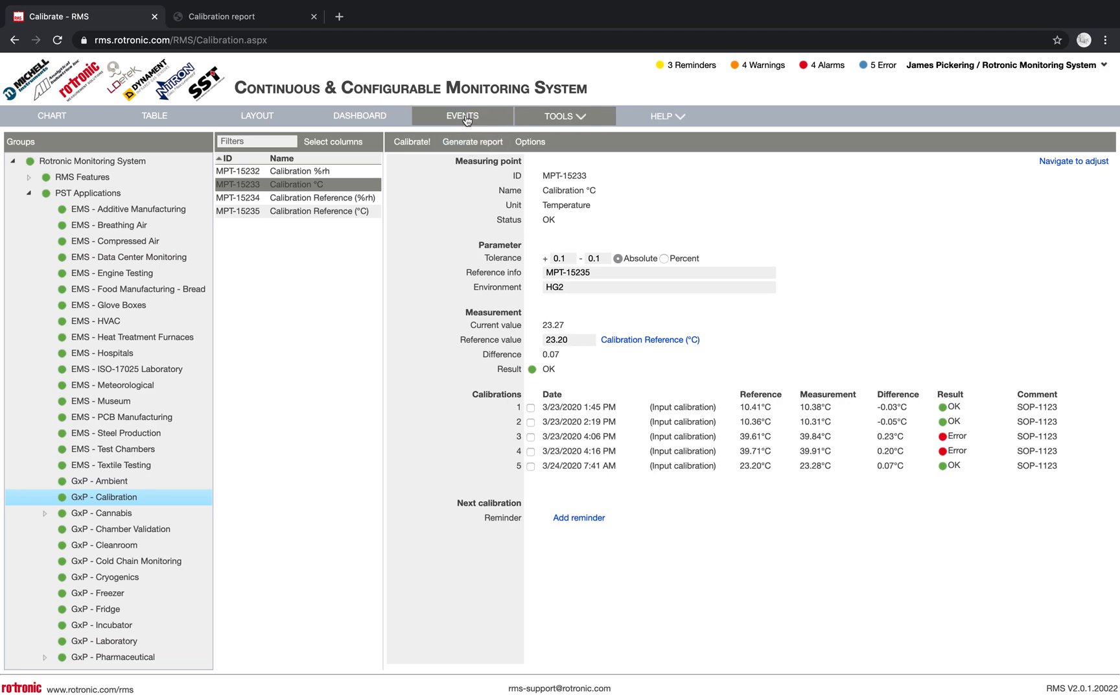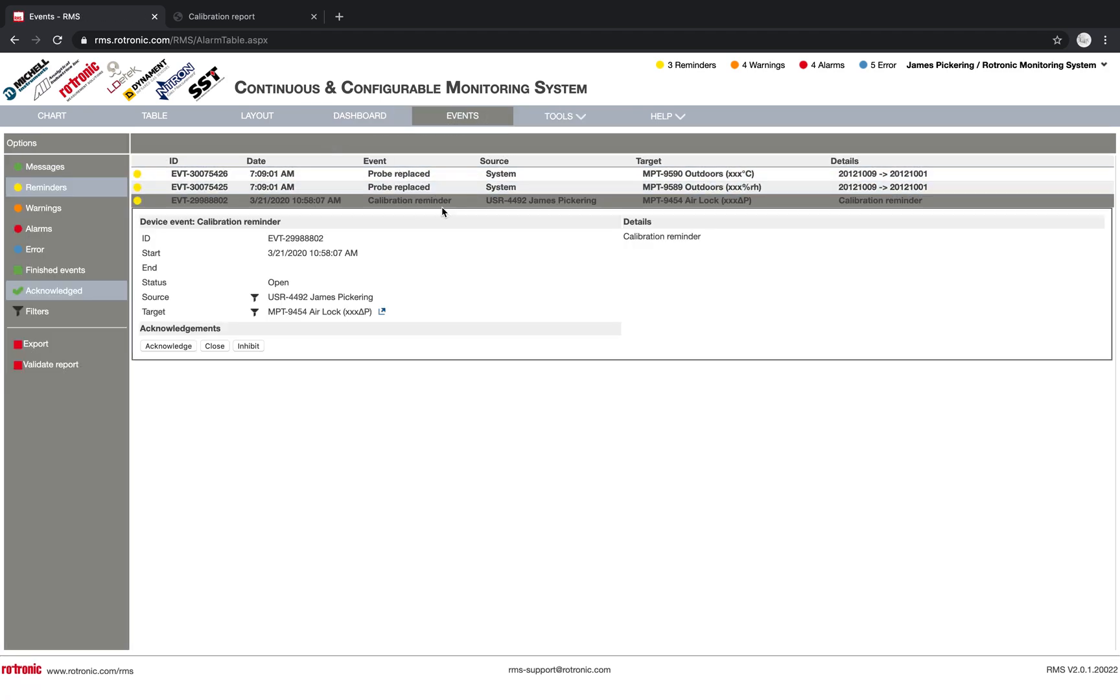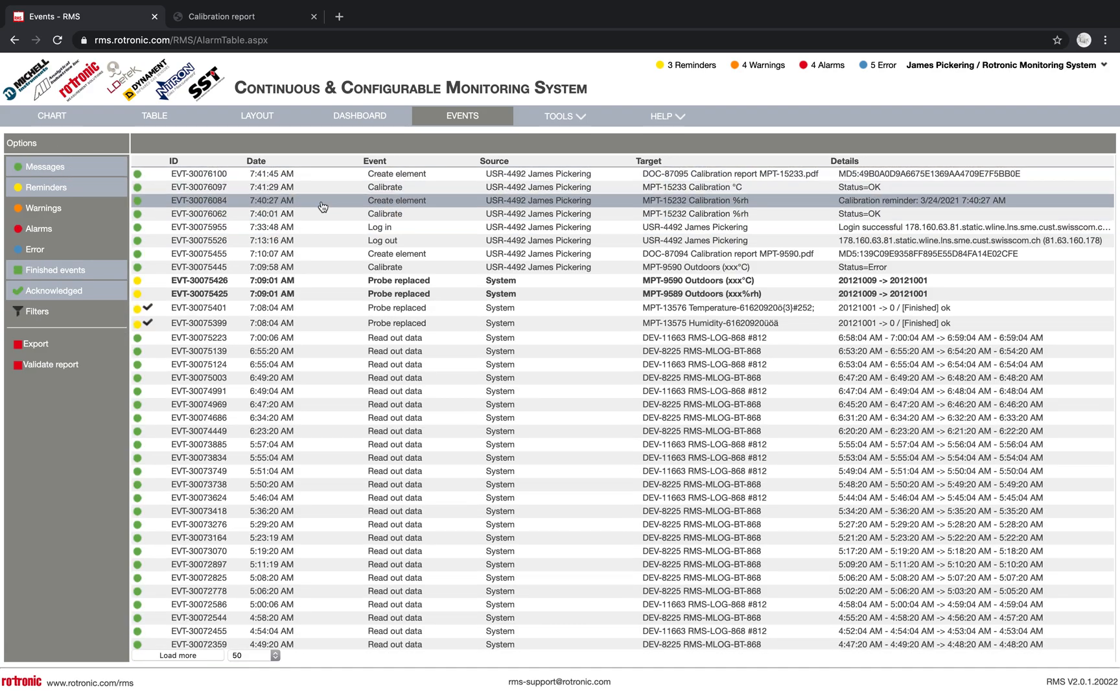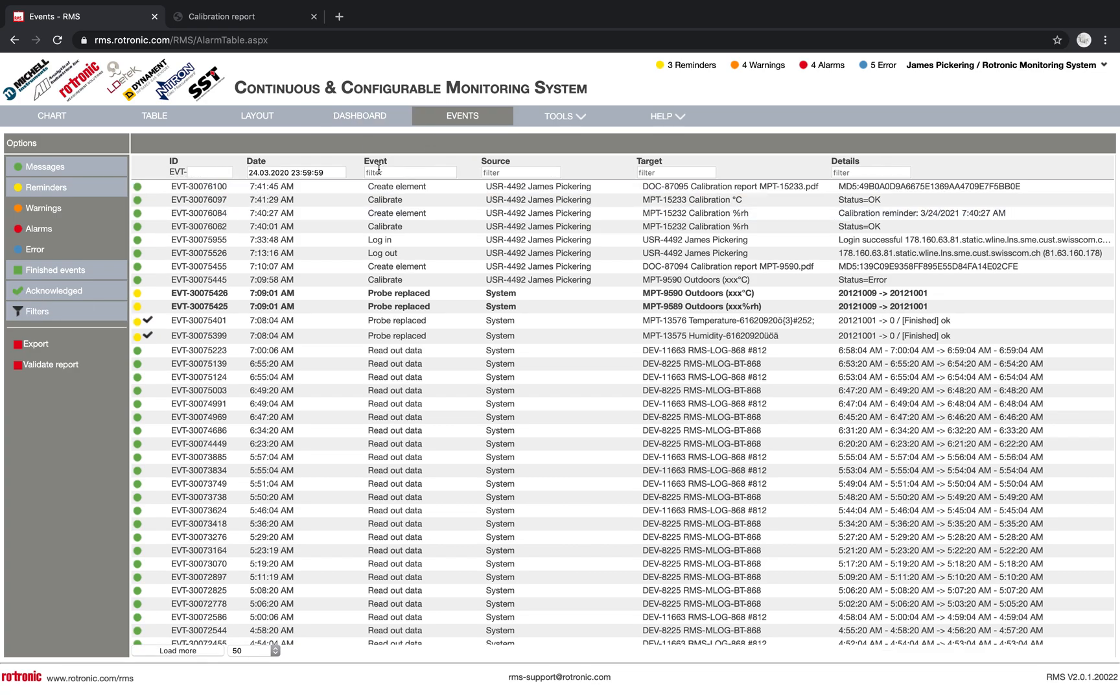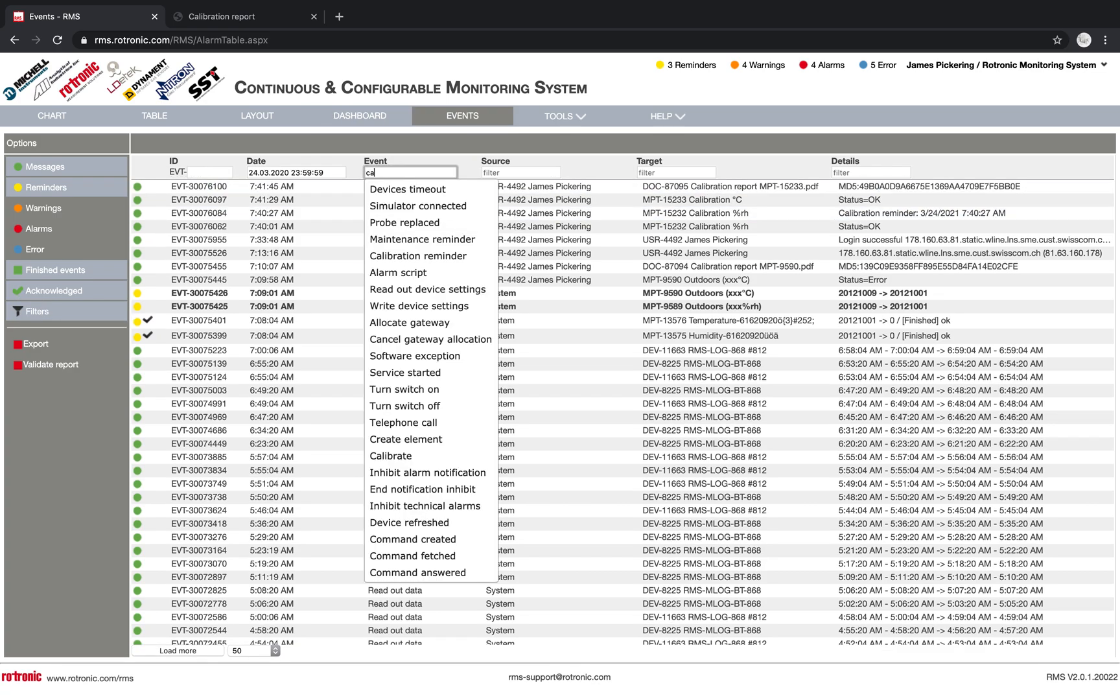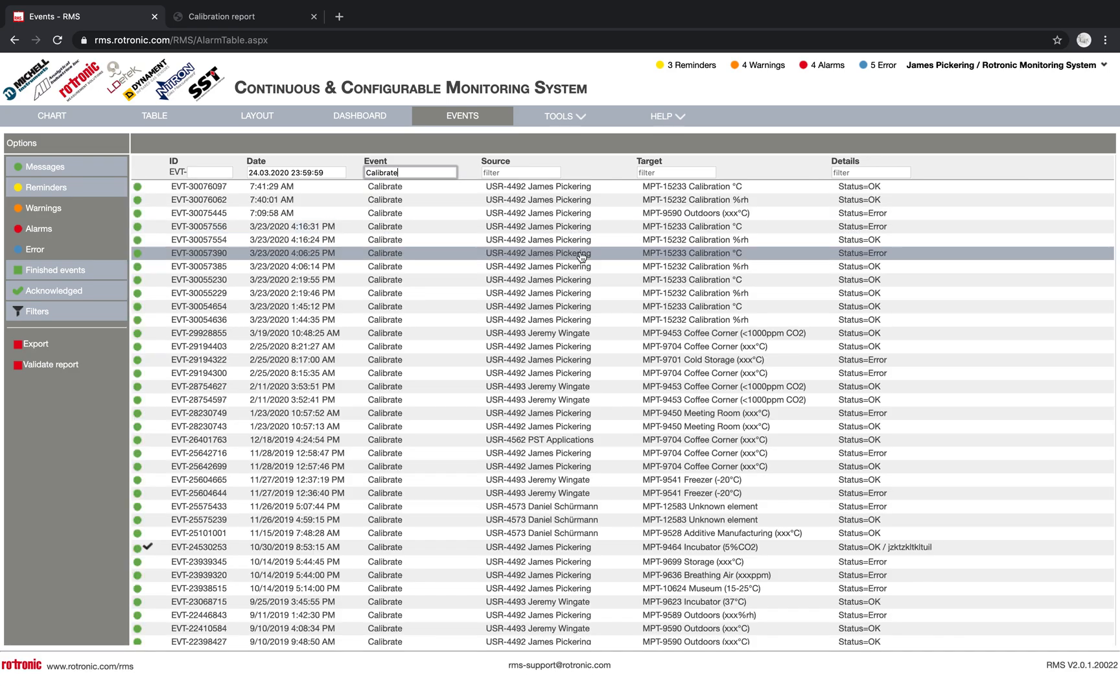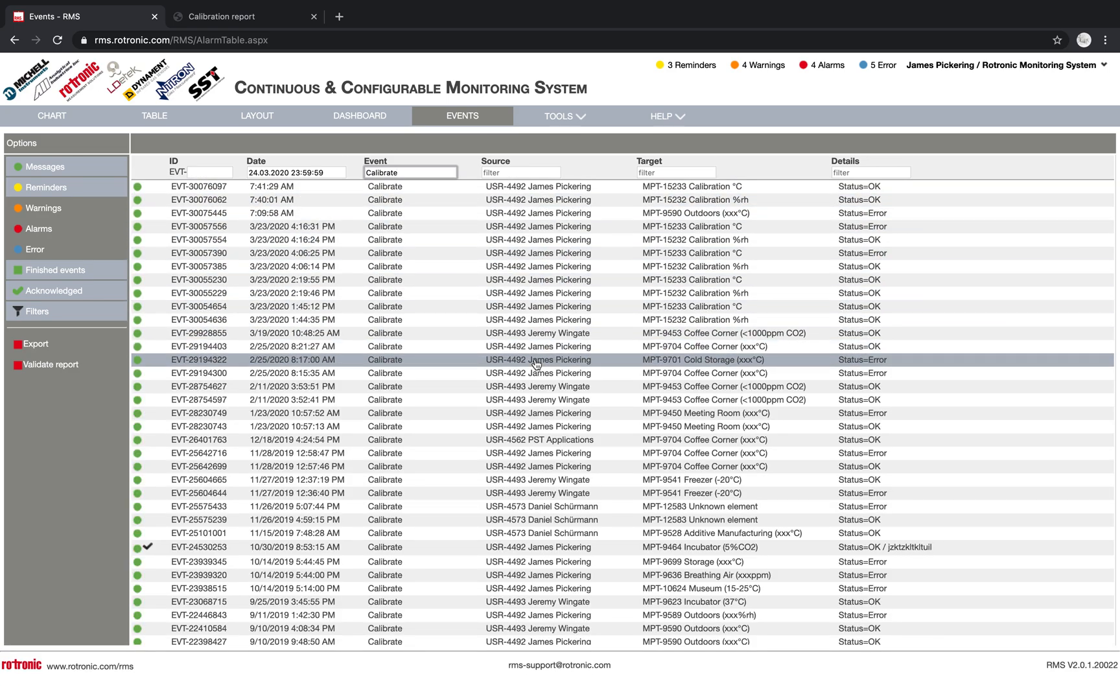If we look under events, or under the audit trail, we already saw the calibration reminder here. But when we click on messages, we can then see once we filter, under the events, if we add in calibrate, we can see then all of the calibrations that have been taken out. So this means that if we do have an audit from a third-party company, we can present to them all of the details within one single system. So this will make it much easier as soon as you do have to show somebody what was calibrated, what are the results.